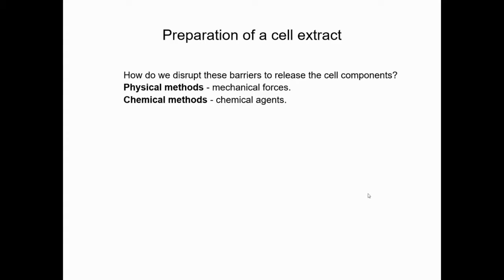And of course, you can use a physical method to break the cell. That would be mechanical force, like the sonicator that we normally use in the laboratory to break the cell. All right, that's a physical method.